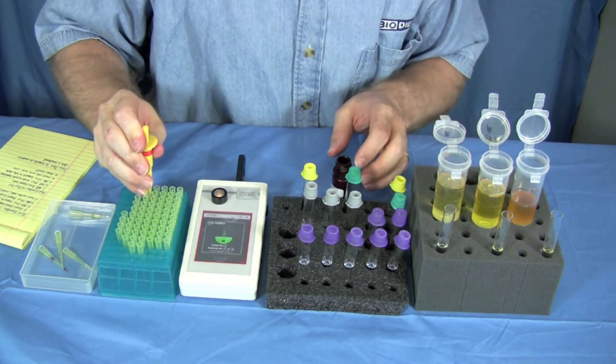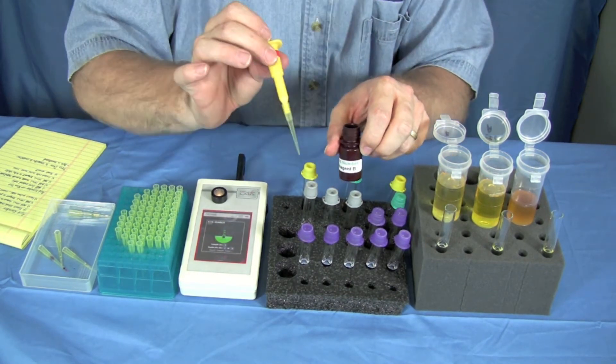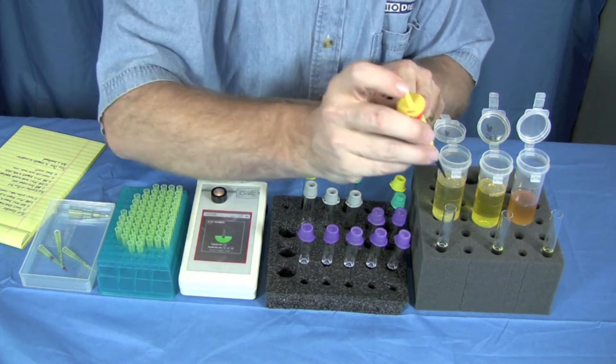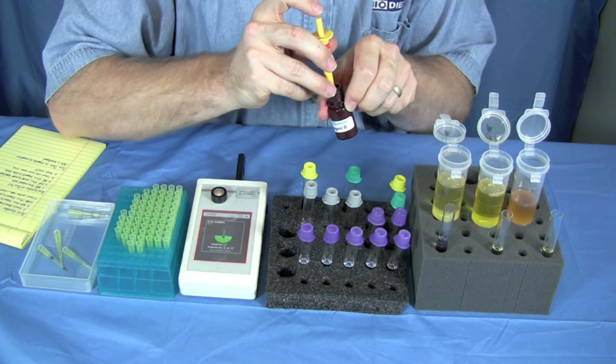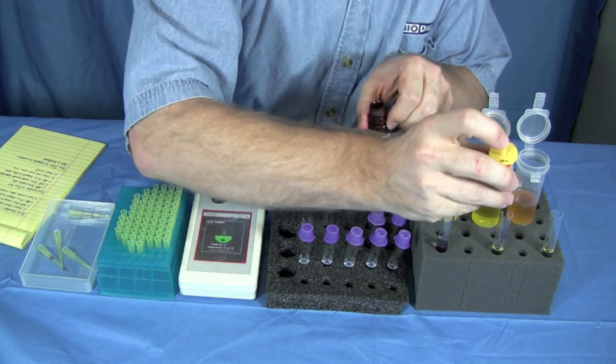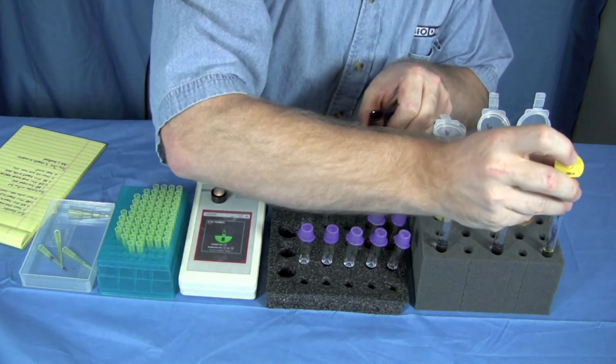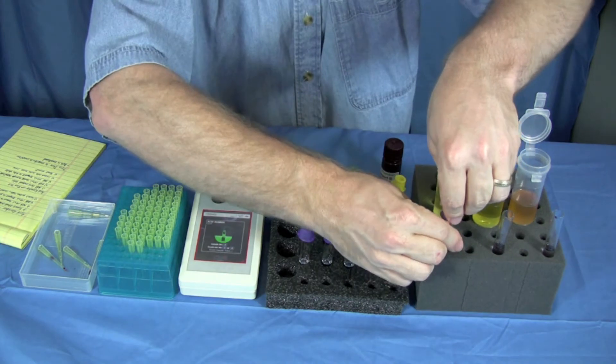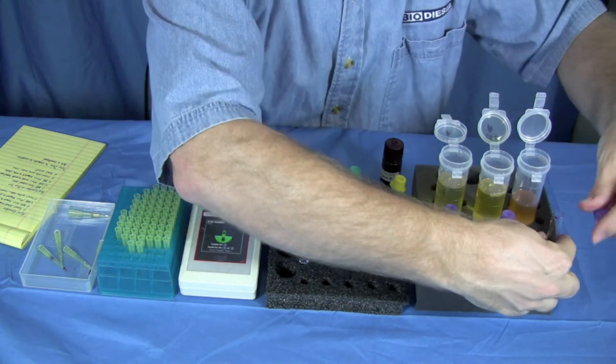To prepare the rest of the samples we use our reagent B, 150 microliters. 150 in there, 150 in there, 150 in here. We then replace the caps on the tubes that we're using. We're going to shake these vigorously and then we can get started testing.